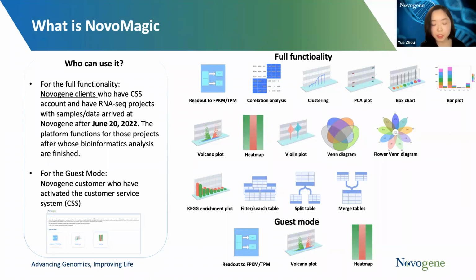So it means that a lot of the functionality of this platform is not limited to the projects. You can always upload any format of your data, and you can play around with these functionalities. If some of you are having trouble finding the right format for the different analyses, or if you want to confirm with us whether you're eligible to use it, you can definitely leave a message, and our project coordinator will contact you about the details, tell you the situation, and try to find a solution for it.